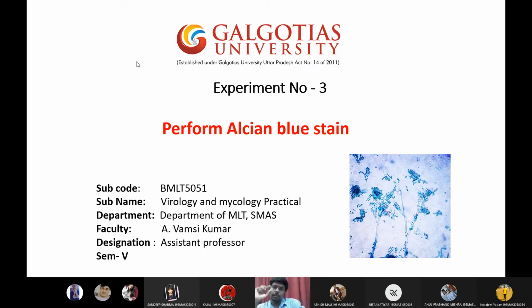I will create a colored substance which will have specific attraction to the glycogen, so that by this stain I can target glycogen in the cells. Now this became a glycogen specific stain. So creating specialized stains to visualize specialized parts of the cells has an advantage: rather than seeing the whole cell, we are seeing a specific part of the cell.